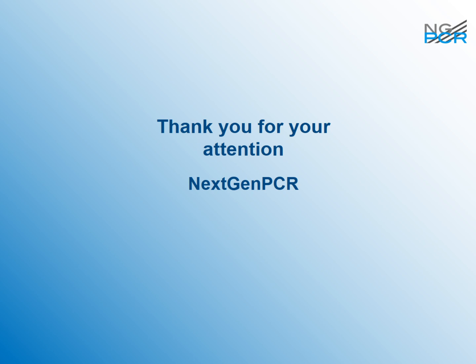But then again, I had a discussion with Carl Whittler just last week, and he told me that in his experience, the extension zone is the one to leave alone, and you can squeeze the timing for the annealing zone. And of course, if you increase the concentration of primers, then the annealing zone is a very good candidate for squeezing down the time. Okay, brilliant, thanks, Gert. Are you planning to make it real time? Yes, we are working on it, and in the course of next year, we should have one.